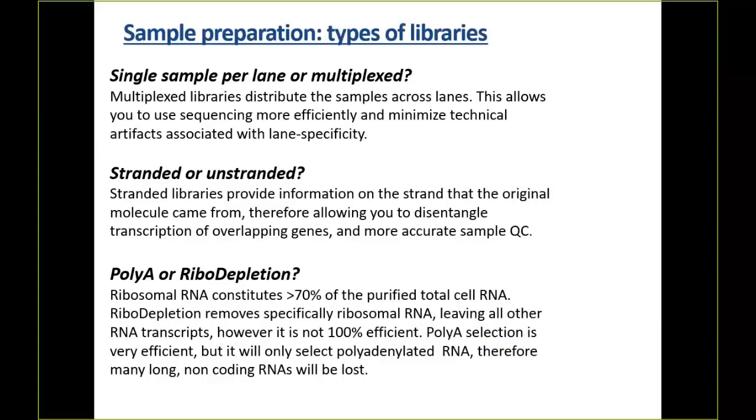What's another thing that poly-A is going to select for that maybe people don't think of at first? Can anybody think of this issue? This is a less commonly thought of one, but it's actually a really big one. I've seen a lab literally tank about $20,000 on an experiment where they used poly-A and they shouldn't have, and it completely wrecked their data.